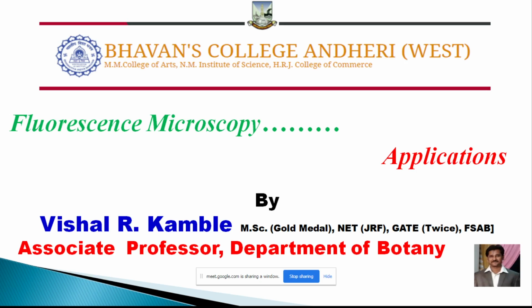This microscope basically uses much higher intensity light sources which excite a fluorescent species or fluorophore, as you can call it, in a sample of that particular object of our interest for microscopic investigation. So this fluorescent species or fluorophore in turn emits a lower energy light of a longer or higher wavelength that produces a magnified image instead of the original light source. So the enhanced image, as compared to the light microscopic image, is totally different.